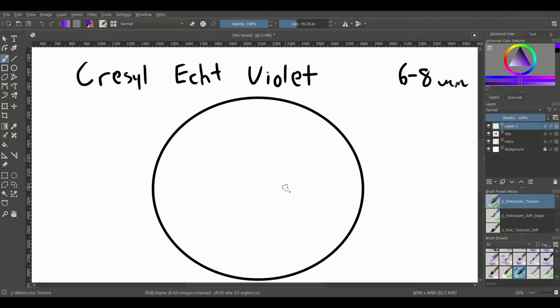For some reason, using balsam can be a bit more gentle than other reagents, and it might give it an action of protecting it from differentiation. So that might differentiate other things more, and the surrounding nuclei might fade out just a bit compared to the Nissl substance. I'm not entirely sure on that, but that would be my guess.